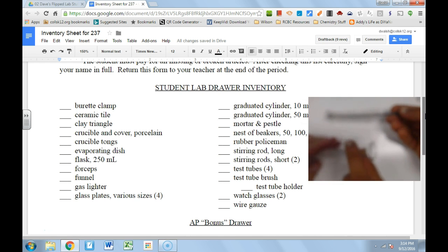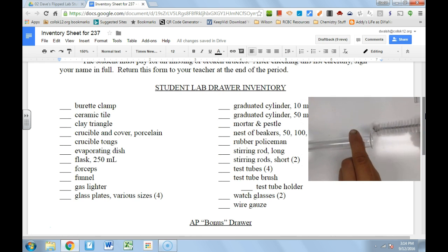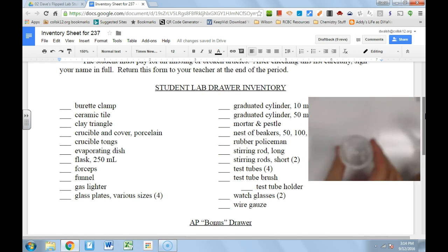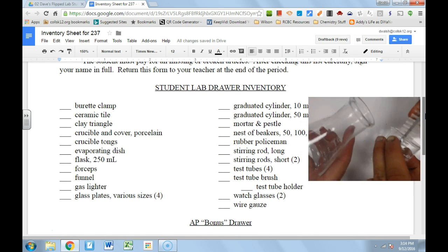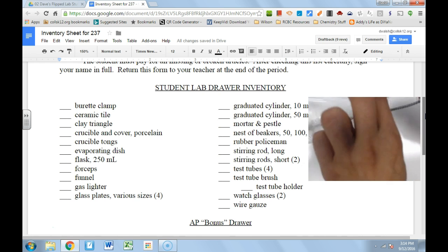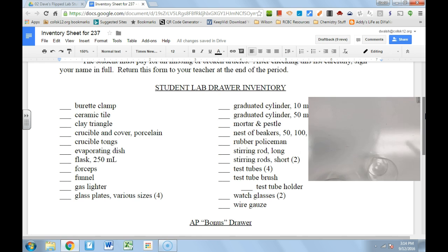For the test tubes, we also have this wonderful test tube brush. The test tube brush is perfectly sized for scrubbing your test tube to make sure it's nice and clean. It also works on our other pieces of glassware — you can clean a beaker very effectively or get inside a flask. The uses for this test tube brush are actually endless.